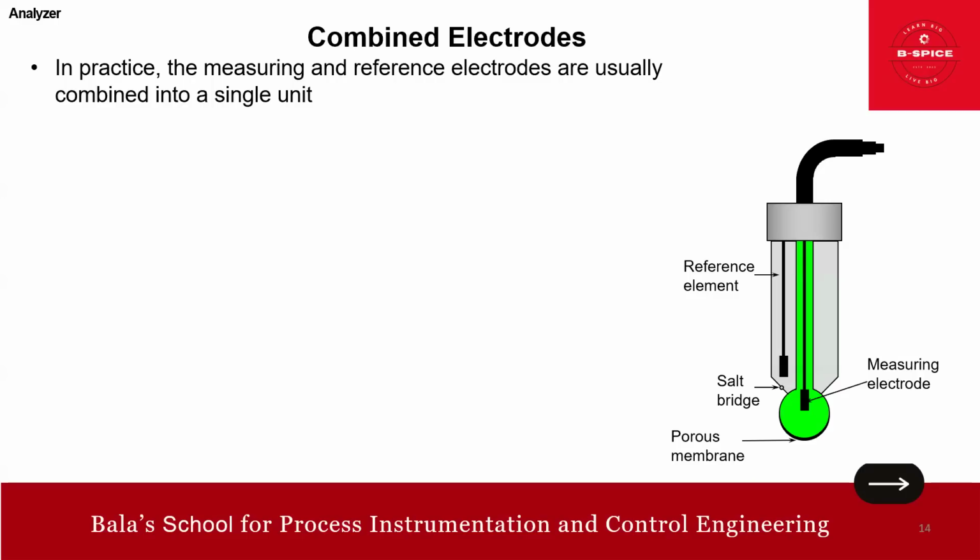Now we are going to see combined electrodes. In practice, friends, whatever we have covered is more of a theory. Nowadays, the measuring and reference electrodes are usually combined into a single unit. You can see here, this is the reference element and this is the measuring electrode. So this is the salt bridge.